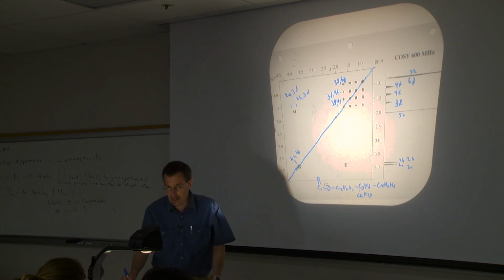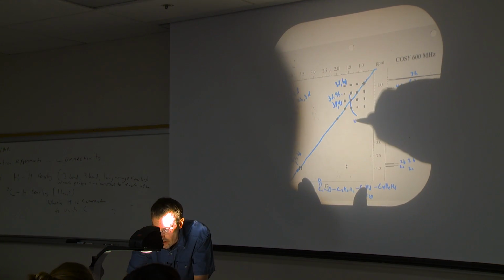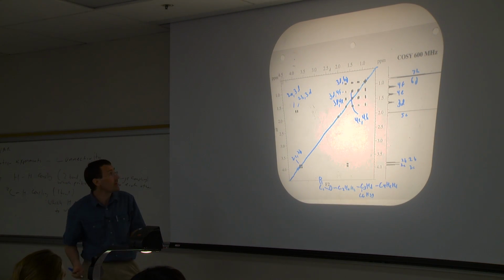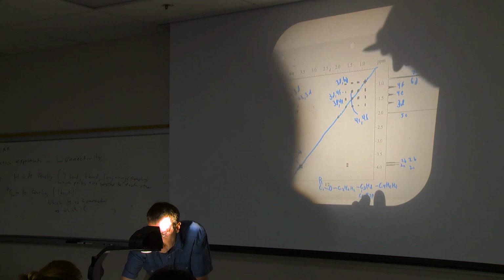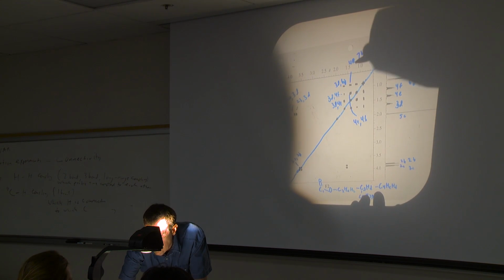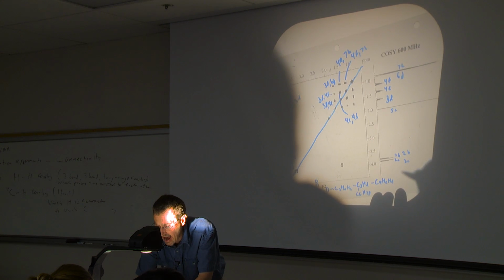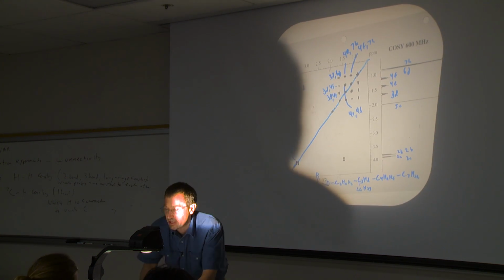Let's finish up. We've got a couple of cross peaks here. This cross peak doesn't really tell us anything new. It's 4E with 4F. That's just a diastereotopic methylene crossing with itself. The last two cross peaks here, that's 4E with 7H. And this one is 4F with 7H. That completes our chain. C7H3H builds out our chain.